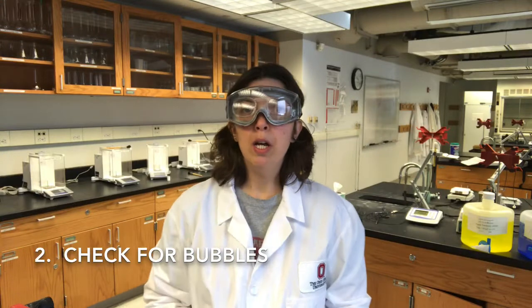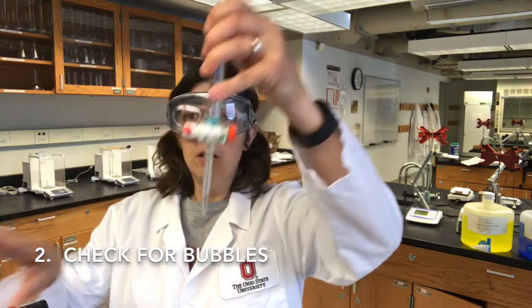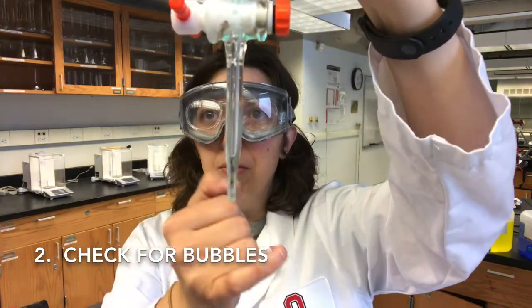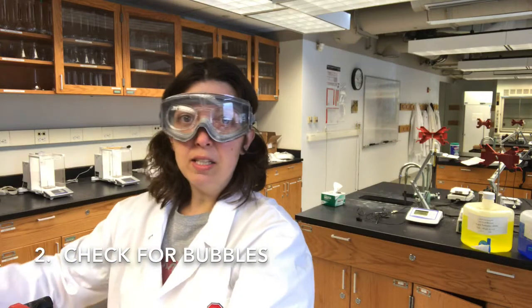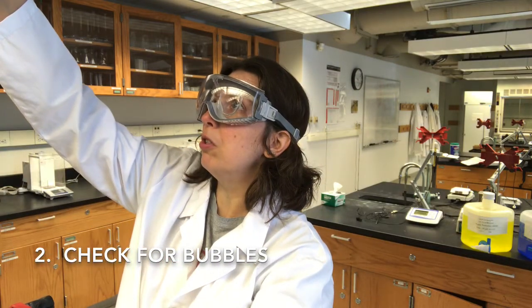Number two: make sure there are no bubbles in the tip of your burette. So here's my burette. If this were my actual solution, there would be a huge bubble in there. A couple of ways to make sure you get rid of bubbles — I'm going to add a little bit of blue solution to my burette.